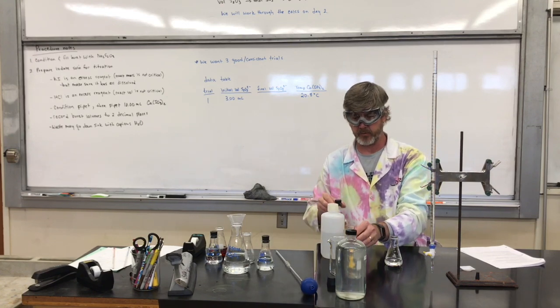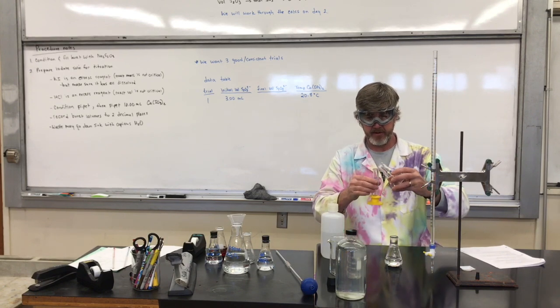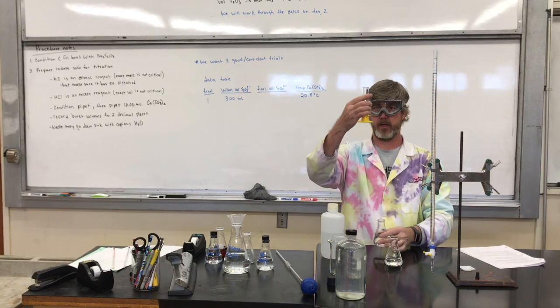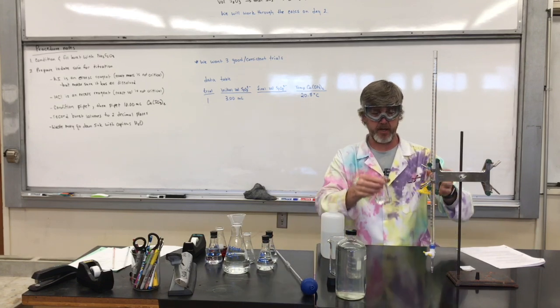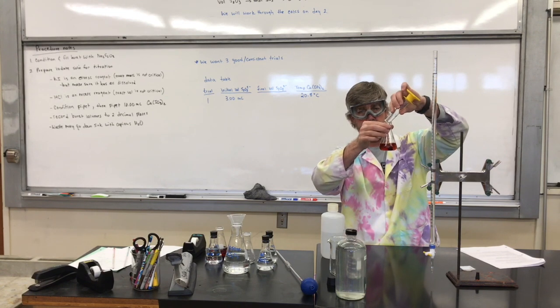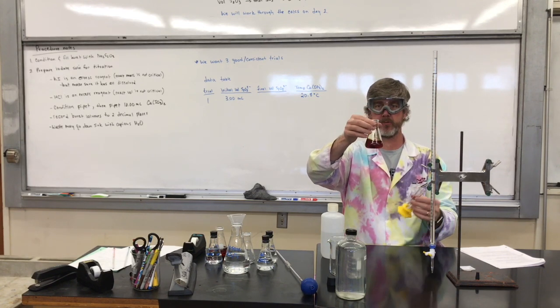That's one of our excess reagents, so it doesn't matter exactly how much we add. If you add a little bit more or a little bit less, that's okay. That's pretty close to 10. That's good enough. We're going to add this, and now when we add our HCl, the solution is going to turn kind of that burnt red, brownish, orangish brownish color.